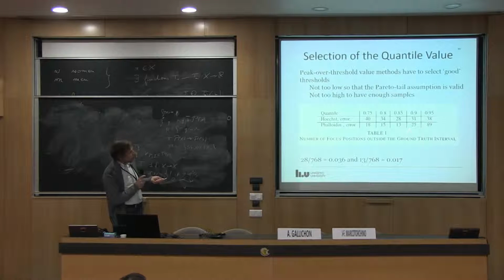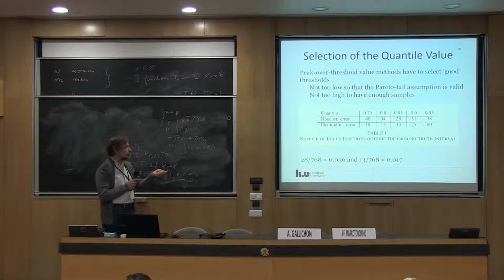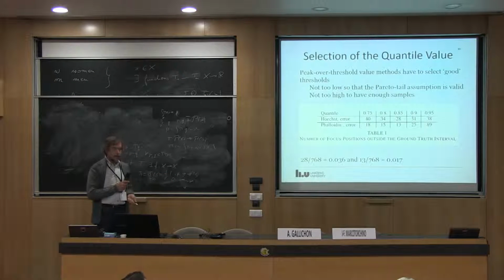And then you see here, for example, if the quantile is 0.85, then 28 samples from this staining here were wrong. And this is the case because these stainings are of this blurred type that I showed as a negative example. If you have this staining here, you have a much more detailed image structure in general, and then only 13 of these sequences were misclassified at the wrong position. So 1% here and 3% here.